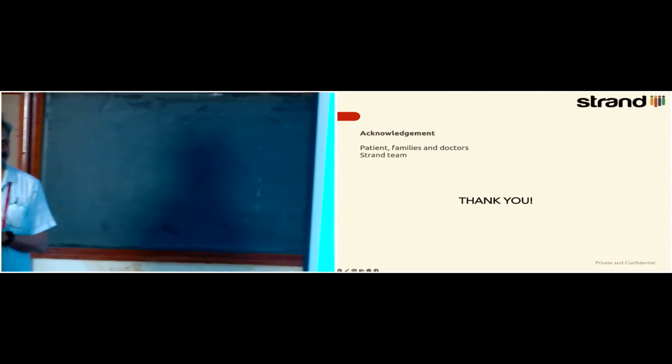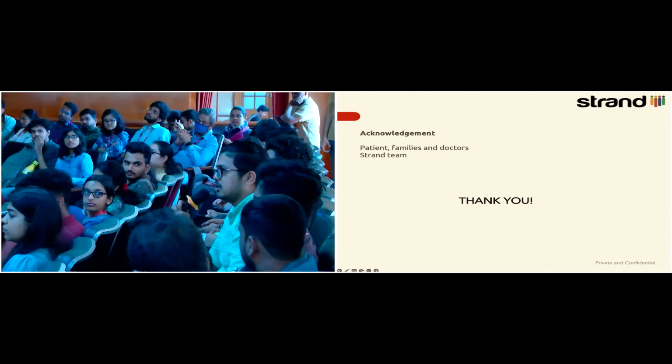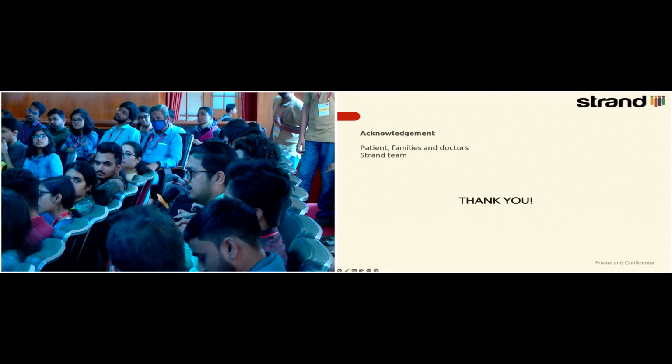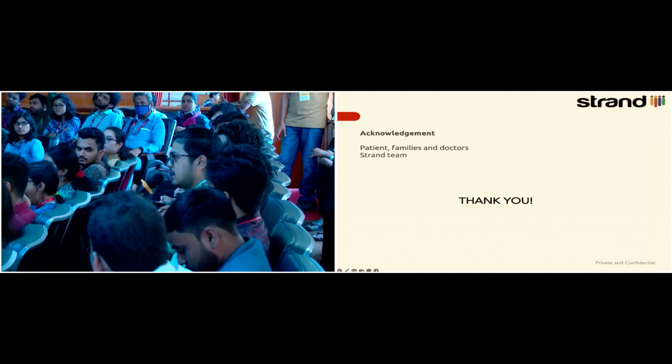Hi, it was a very well detailed talk. So, if I'm not mistaken, you are calling CNVs based on coverage depth, difference in coverage depth. So, is there any other factor than the CNV present which can affect the coverage depth? And if yes, how are you dealing with that?